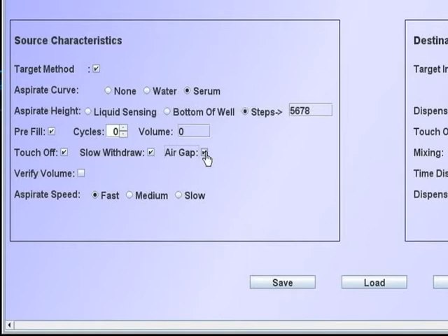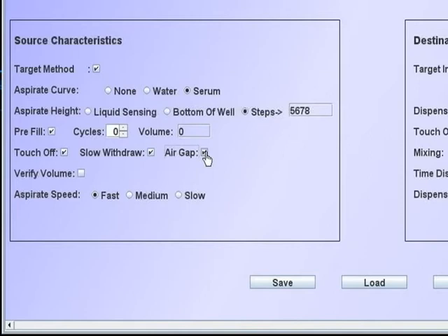A note of caution. The 5 microliter air gap will affect the meniscus readings. Normally, a 5 microliter air gap is drawn after every aspirate. The meniscus detector is calibrated assuming the 5 microliter air is there.